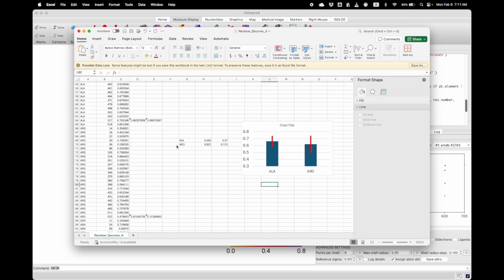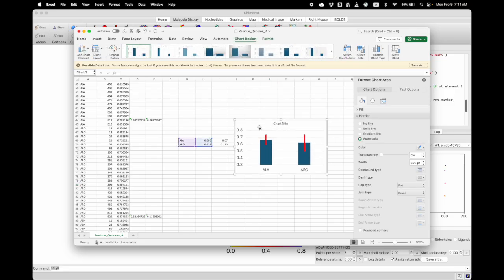We would like you to do this for all of the different types. There's only about 20. It can be done more manually like this, or perhaps by scripting with Python. Then we would like you to look at why they might have different averages and different variations in resolvability based on chemical properties. So look up what the different residue types are and what their properties are. For example, they might be more solvated, closer to solvent, or they might be more buried generally. And what are the variations in resolvability for these different types?